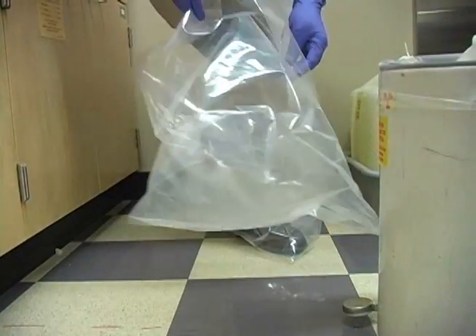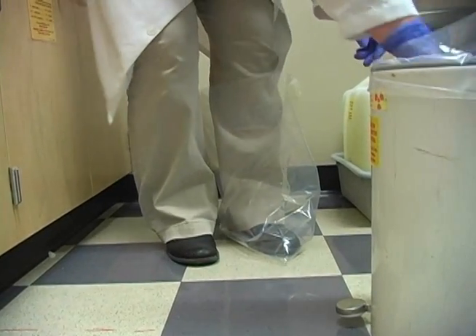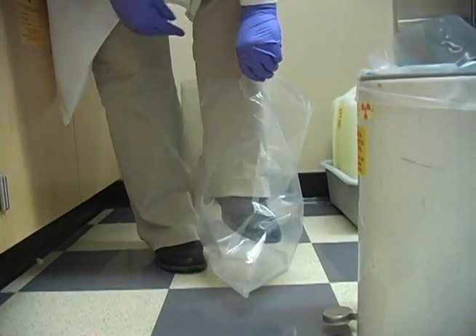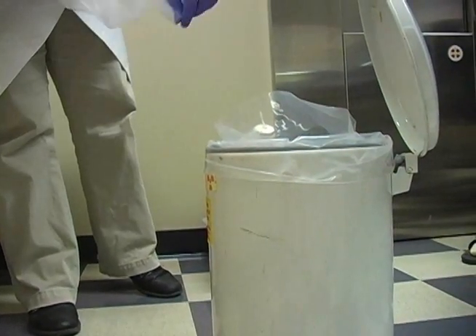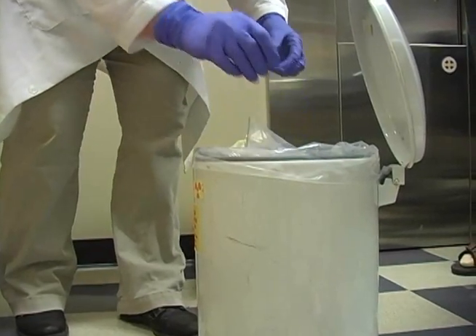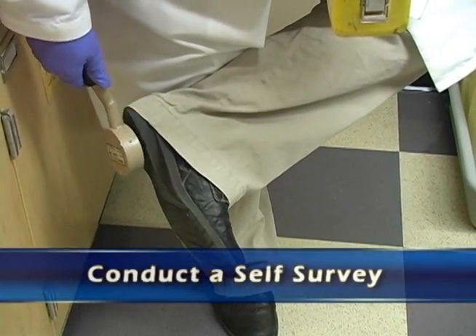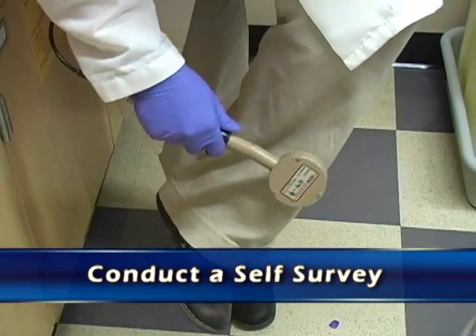When you're finally done, your shoe covers and gloves also need to go into the combustible radioactive waste container. Then you need to survey yourself afterwards to make sure you didn't get any contamination on you while doing this job.